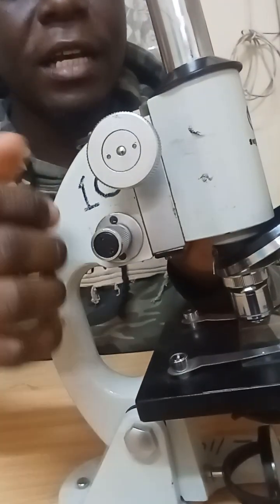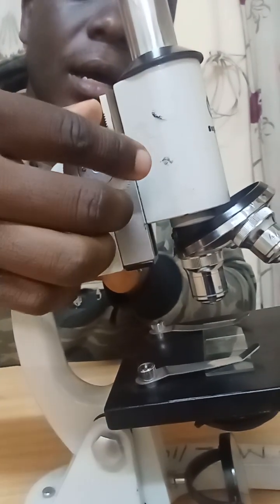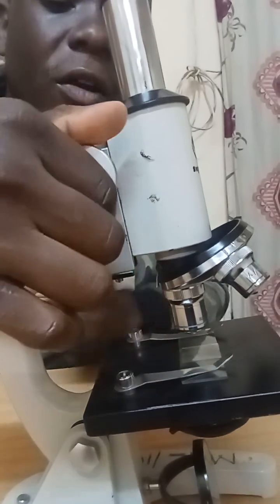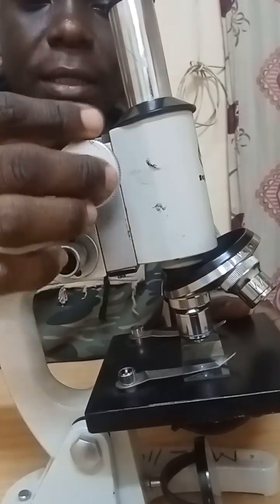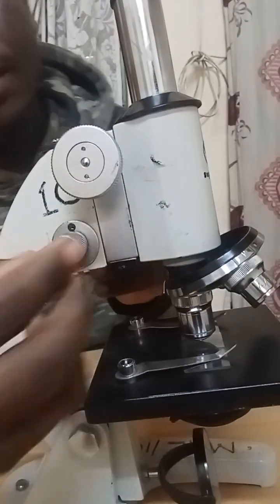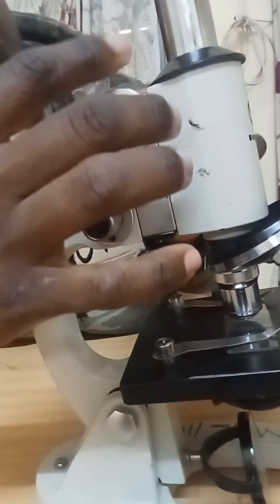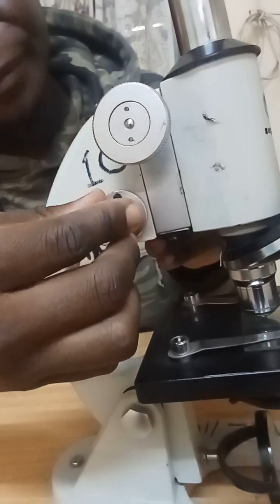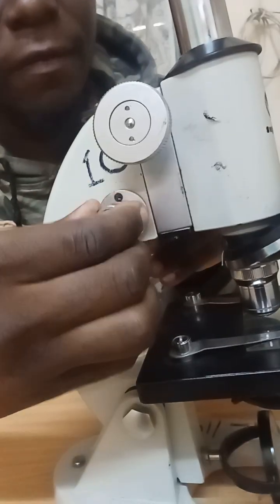And this coarse adjustment knob, as you can see, raises the body tube and also lowers the body tube over long distances to bring the image into a rough focus. As you can see, that is the role of a coarse adjustment knob. Then this smaller knob, we call it the fine adjustment knob. After using the coarse adjustment knob to bring the specimen into a rough focus, we use the fine adjustment knob to get finer details of that specimen.